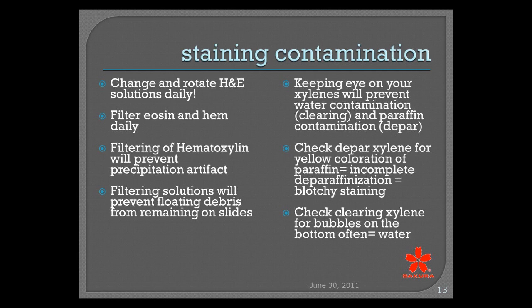As far as your clearing xylenes go, if you're checking your clearing xylenes throughout the day and you see this bubbling effect on the bottom of your xylenes, then you have water carryover from your alcohols. Basically, your 100% alcohols in your H&E line are no longer 100% because you're dragging water through from your 95.